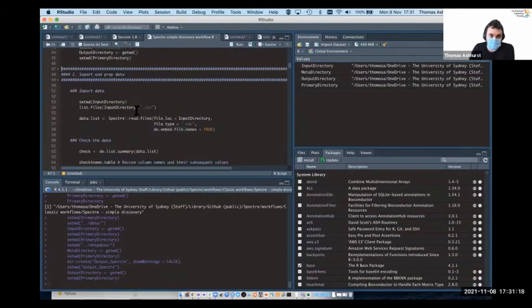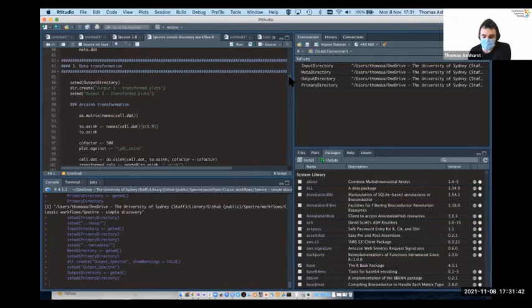Just to give you a brief overview, the steps are in most cases going to be very, very similar, regardless of what's actually being done, because the broad steps are always going to be in common with each other. The very first thing we have to do is pull our data in, because by definition we can't do any work without the data. Then we're going to do some preparation of the data.